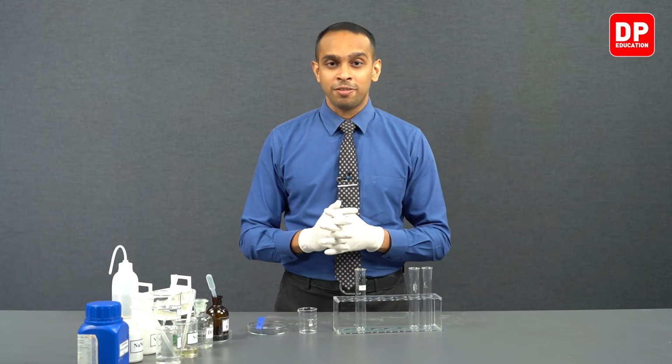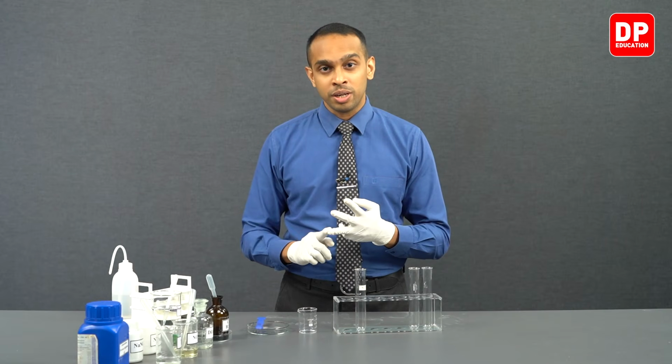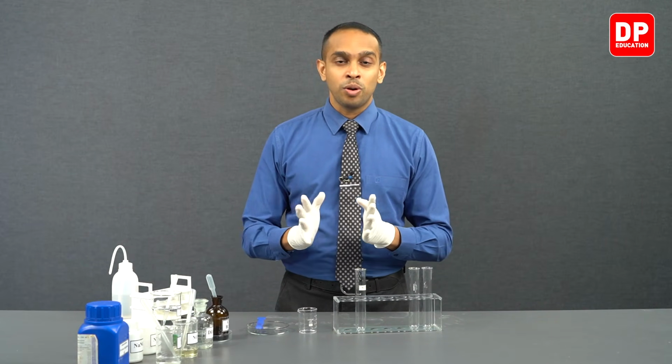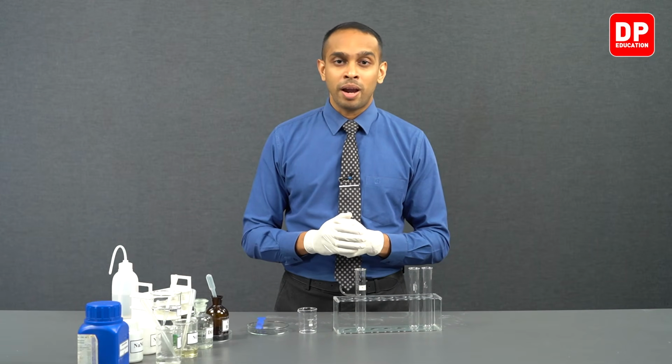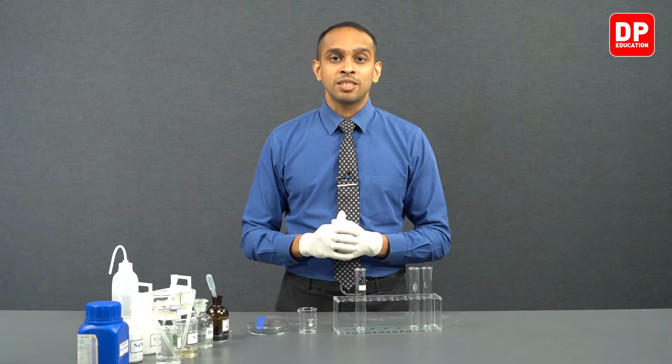So in the presence of sulfuric acid, Fe2+ and NO3-, you will observe a small reaction taking place where Fe2+ is getting oxidized to Fe3+, while NO3- turns into nitric oxide or NO. So Fe2+ ions that are present in the medium and NO molecules that are formed along with water ligands will form a brown color complex, and that is what we observe as the brown ring that forms at the interface between the sulfuric acid layer and the Fe2+ and nitrate ion solution layer.